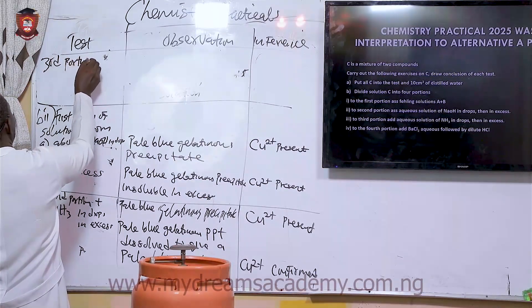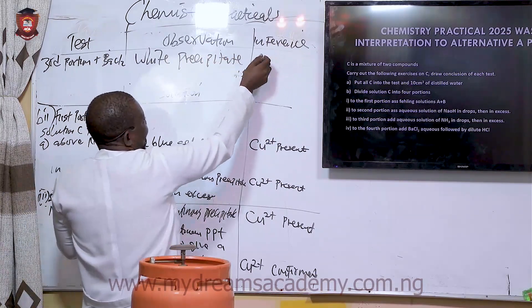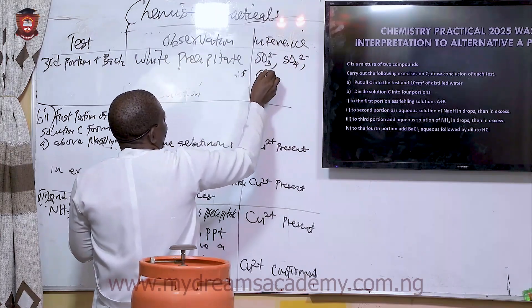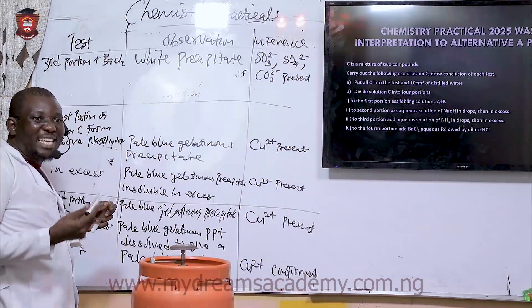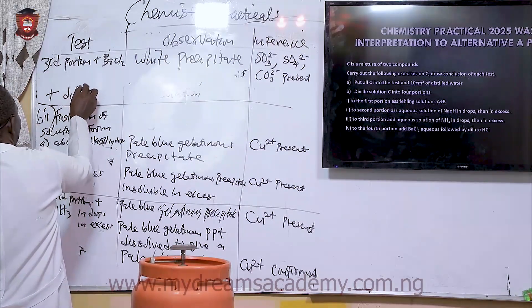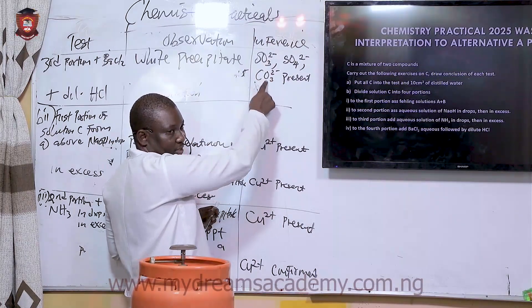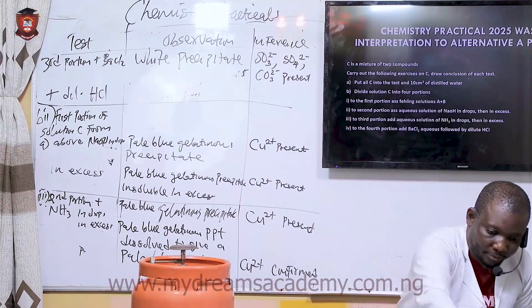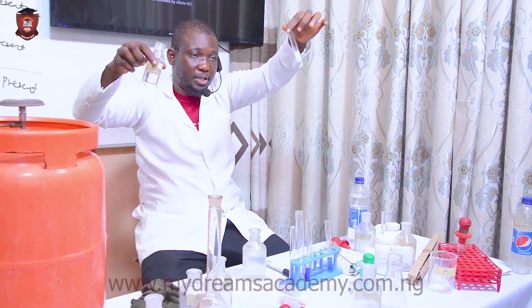Third portion plus BaCl₂ gives a white precipitate. There are several anions you could suspect: sulfates, carbonates. To distinguish between them, add dilute HCl. If it is carbonate or sulfite, the precipitate will dissolve. If it remains, it is insoluble — which would confirm sulfate. Let's add HCl now.